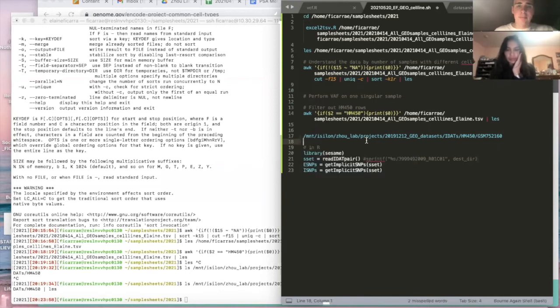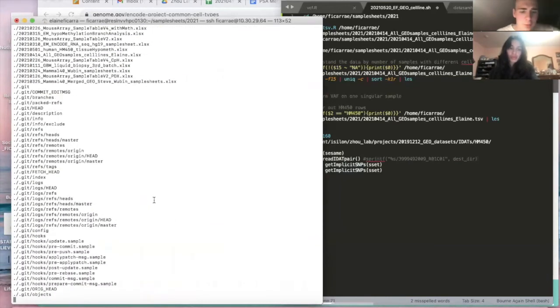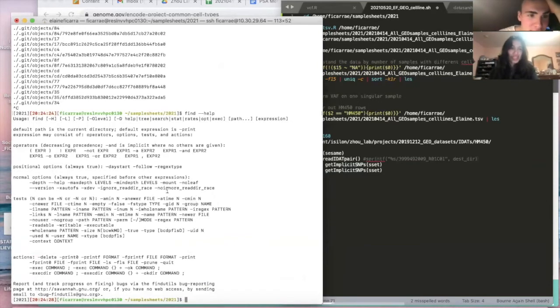Let's try to do something easier. I don't know if this is gonna work at all. Okay, so find is another command that is helpful. Does Control C stop something? Yeah, it stops it. Okay, that's good to know. If anything's going out of line, just use Control C.